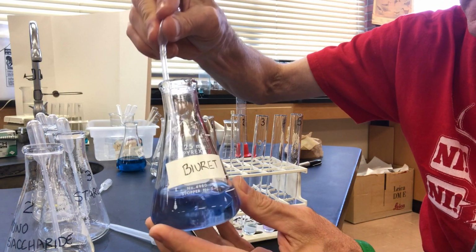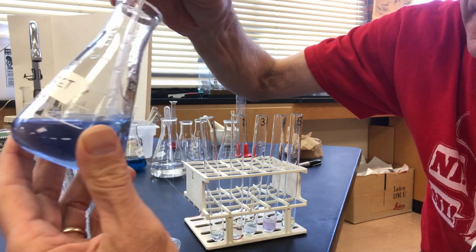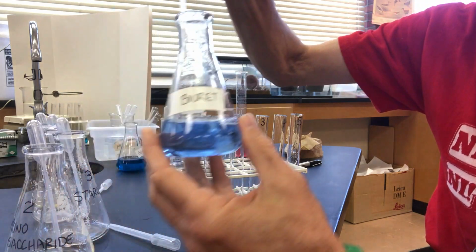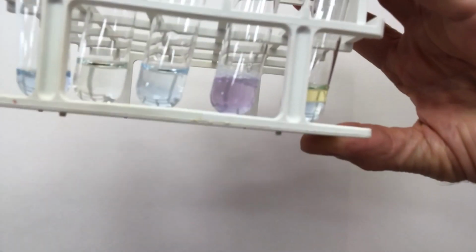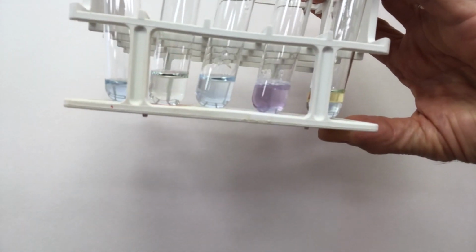Once again, fill 5 clean, labeled test tubes with 1 milliliter of the known samples. Next, add 1 milliliter of the Biuret solution to each tube. Swirl each tube to mix. Compare the samples to your negative control to identify a change. You can see that only test tube number 4 has changed by turning a deep violet color.